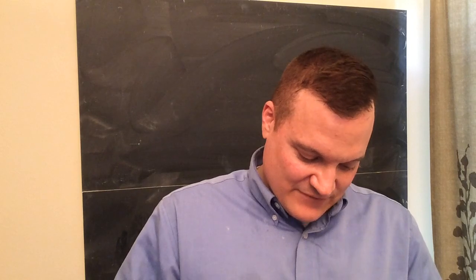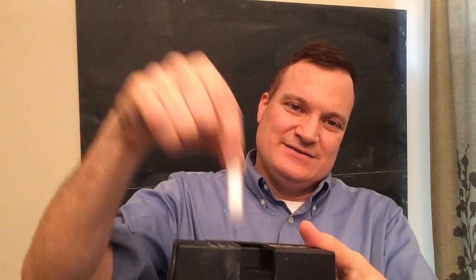Or there's also one like this, a computerized one called a colorimeter. Colorimeter or spectrophotometer. The spectrophotometer is the more expensive, advanced version. And inside it you put what's called a cuvette. Inside here, what does it do?